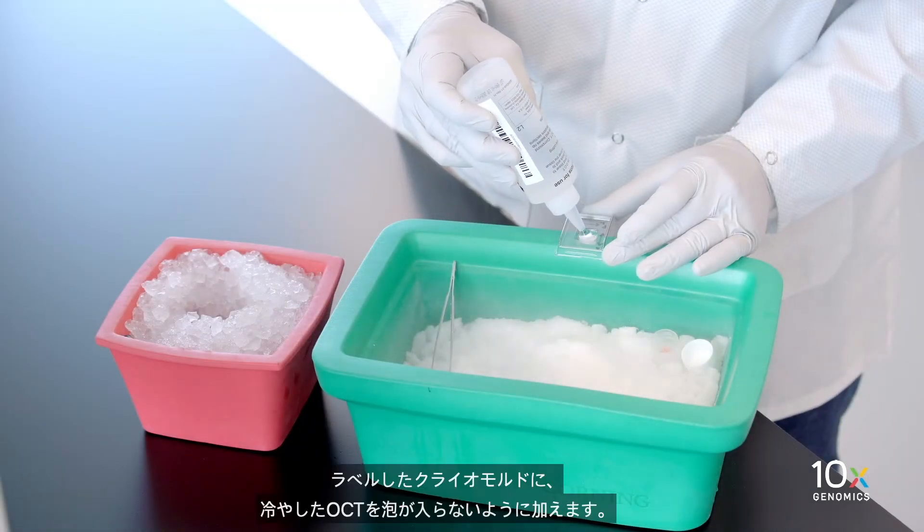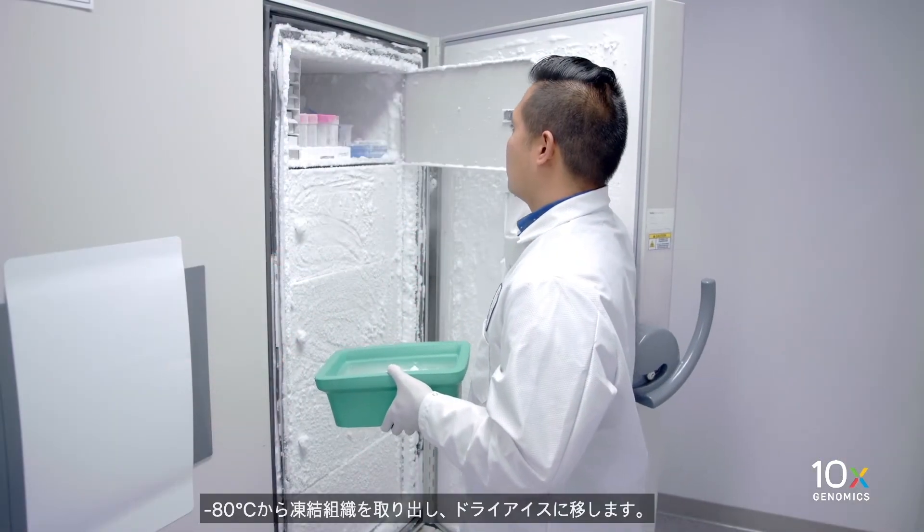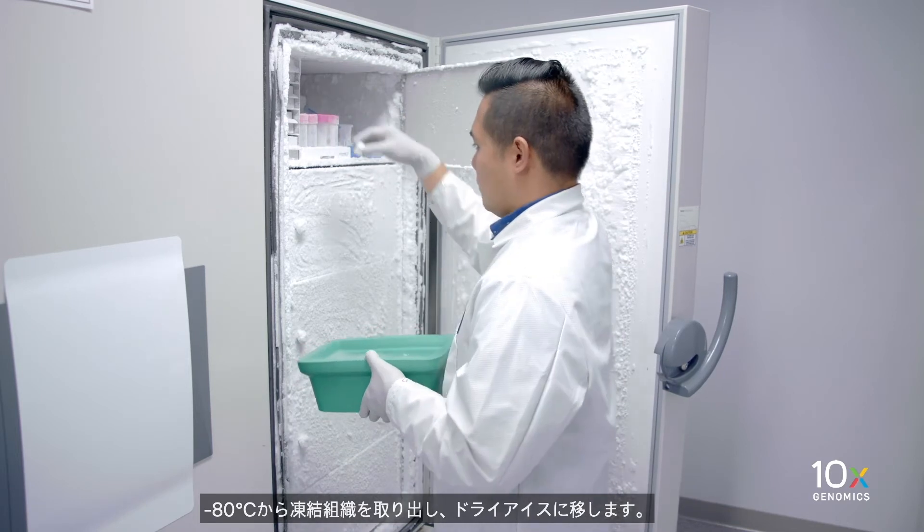Fill the labeled cryo mold with chilled OCT without introducing bubbles. Remove the frozen tissue from minus 80 degrees Celsius and transfer in dry ice.